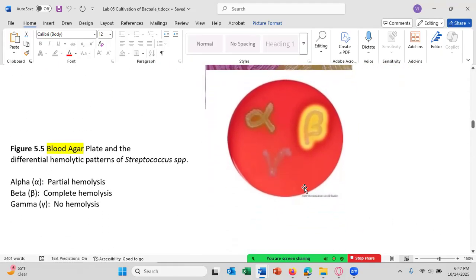And then here's blood agar. It is both an enriched, complex, general purpose media, meaning an enriched media, because it has blood in it to supply nutrients that the cells may require. Streptococcus pyogenes, for example, can grow on blood agar, but cannot grow on a general purpose media, because the blood provides the nutrients the Streptococcus pyogenes requires. So that's what it is, enriched media.